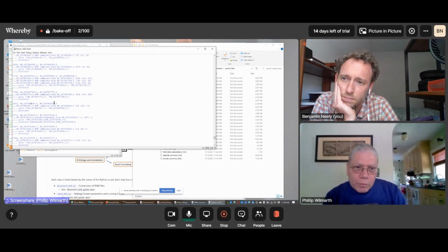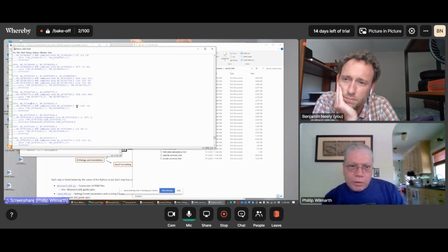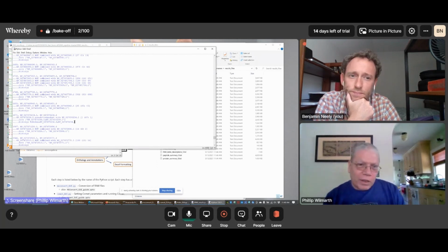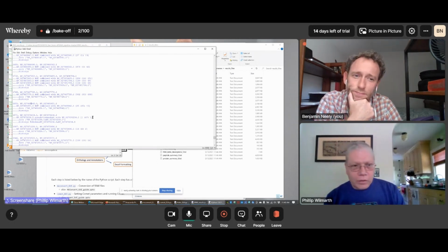But basically, for things like this protein we've got here, two proteins that had some shared peptides, we compare them, and we see that there were 35 shared peptides. The first accession had 25 unique, and the second one had 15 unique. That's enough unique evidence that we don't want to group those proteins together. So they don't get grouped together, and nothing happens. And then we can also get situations like here, where we've got 47 shared peptides, only 1 unique for the first accession, 1 unique for the second. So that's a pseudo-redundant protein, 2 nearly identical sets. So those guys get lumped together.